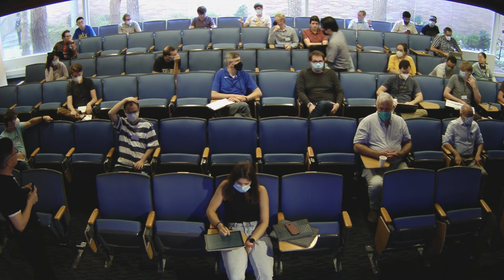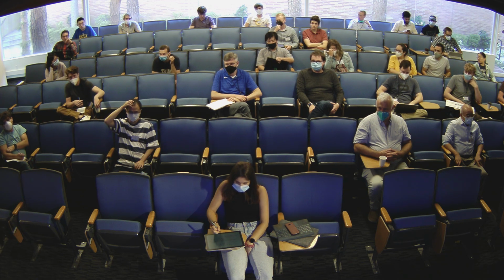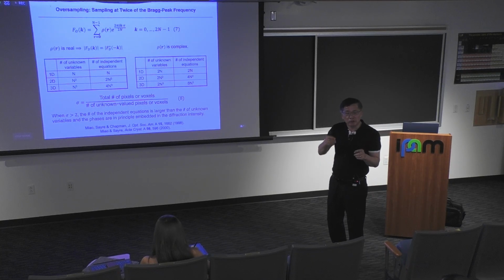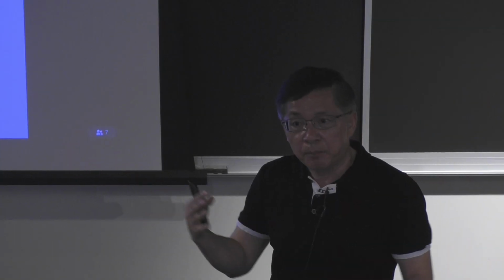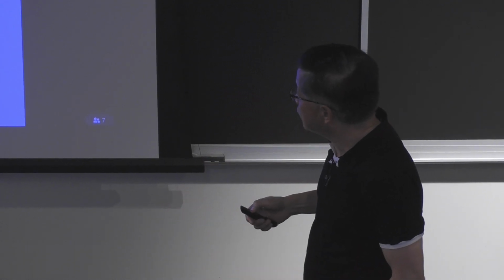But this oversampling, or equivalently padding the zeros, introduces artifacts, right? No, so that's the one thing. Which means the zeros you pad correspond to something you have to measure. You have to measure the intensity. It's not for free. So in math, you can pad zeros. You can pad infinite zeros. But which means you have to measure. In this case, you have to measure the diffraction pattern.